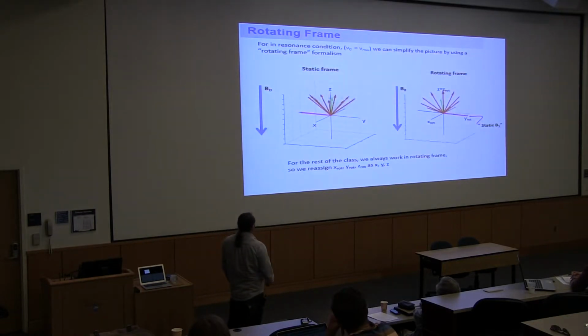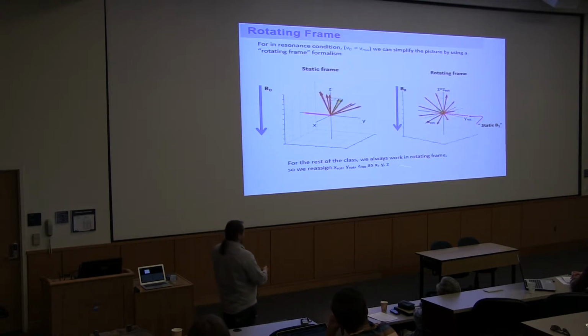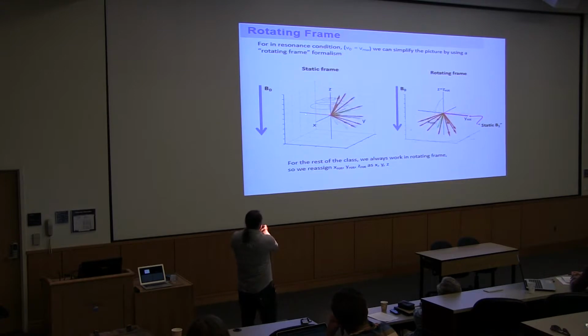All right, now, how does this all look in our vector model? Things are like this. Let's forget about this for now. Let's talk about the complicated stuff. So here is the oscillating magnetic field due to the microwave, which we call B1, by the way.